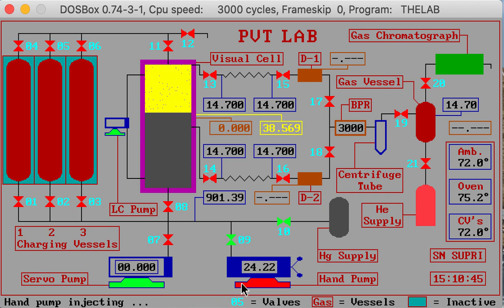Sometimes it doesn't let you do all of it at once, so I just remove 28.5 and then remove the rest, 0.06, 0.068. Sometimes it doesn't let you empty completely. So now I have a hand pump which is empty.